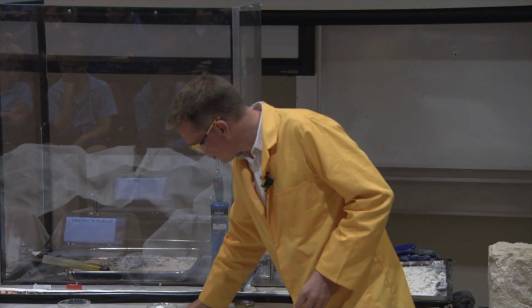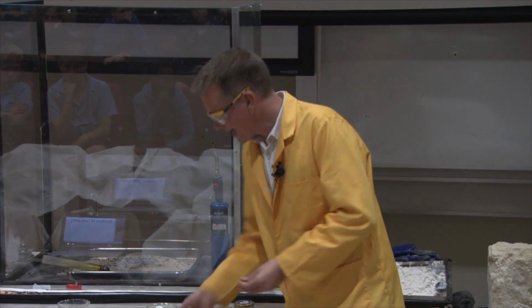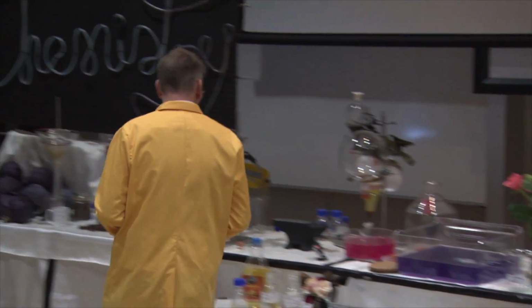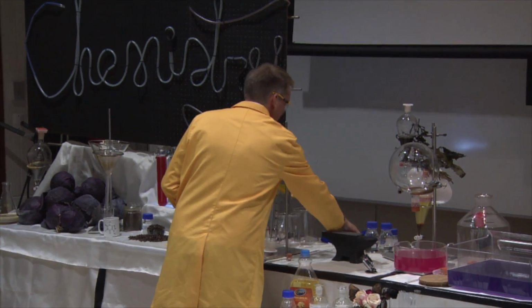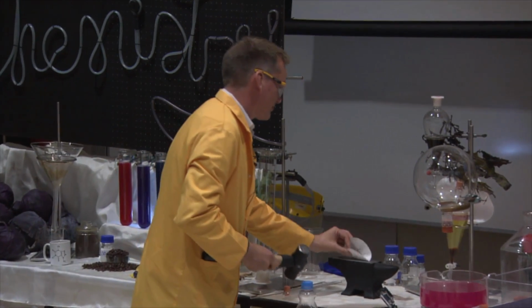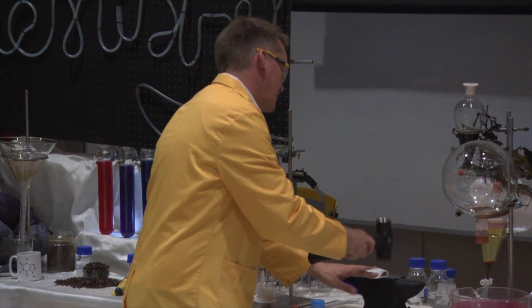Now I'm going to take a piece of fool's gold, and we're going to smash it up with a hammer. Okay? So I'm going to take it over to my handy anvil over here, and smash it up.